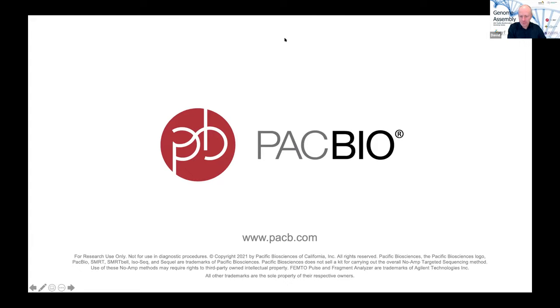So one of the most recent ones: after getting phased haplotype genomes by using HiFiasm plus HiC, can both data be used for HiC scaffolding? Oh yeah, so after getting phased haplotype genomes using HiFiasm plus HiC, can you use it again for HiC scaffolding? I guess that's basically the essence of that. Yes, indeed you can. So that is a possibility. So once you generate both the haplotypes, you can use the same HiC data that was used for HiFiasm to actually scaffold both the haplotypes as well.